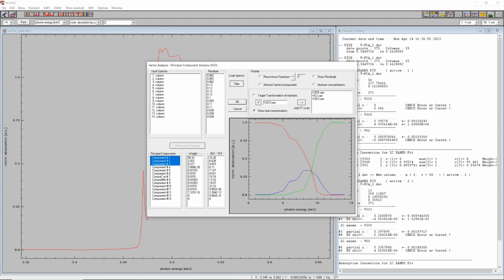For instance, it could actually show up as a 4th component that has no reference, but is just basically due to the increasing temperature during the experiment. So this needs to be kept in mind when actually applying this procedure to real samples and a real example.